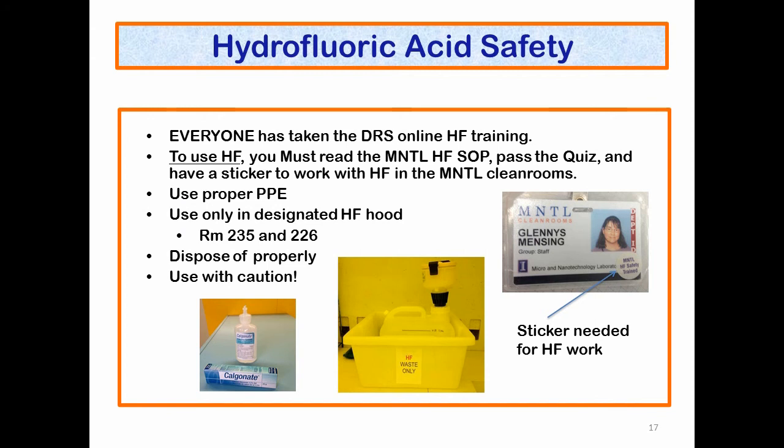Hydrofluoric acid poses significantly higher risks than other acids. Everyone who goes into the clean room must have taken the DRS online training. To use HF, you must have read the MNTL hydrofluoric acid standard operating procedure. You must have passed the quiz and have a sticker on your clean room badge in order to be able to work with HF in the clean room.